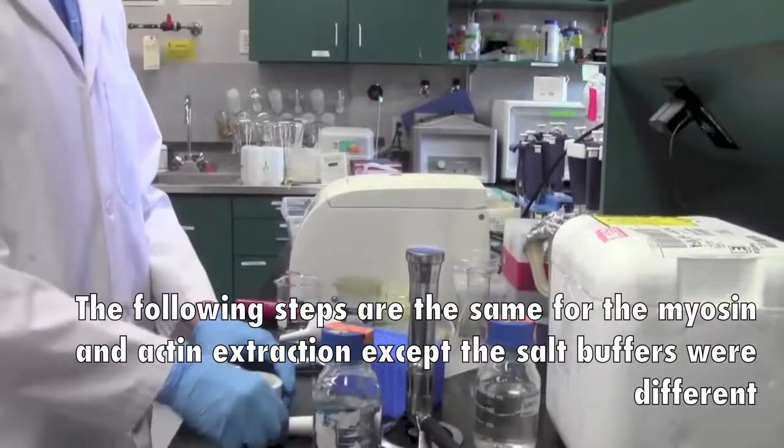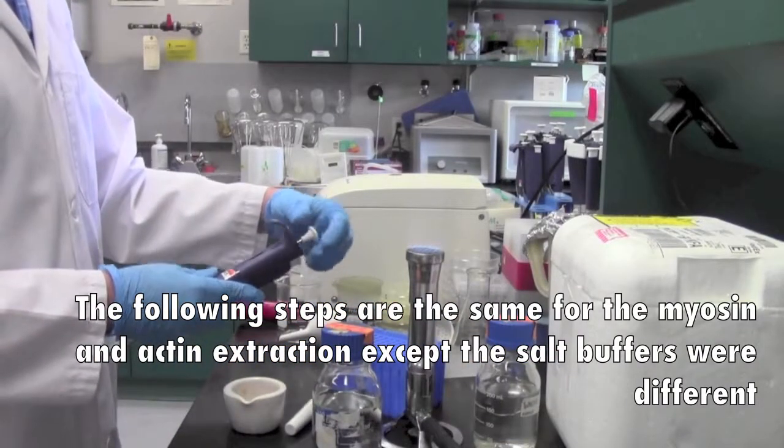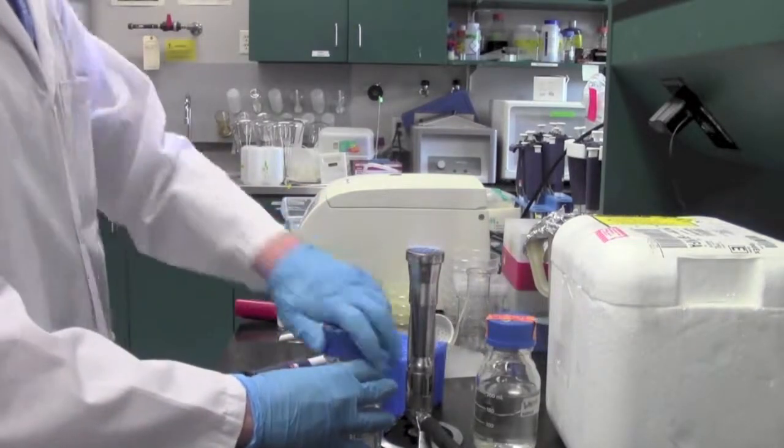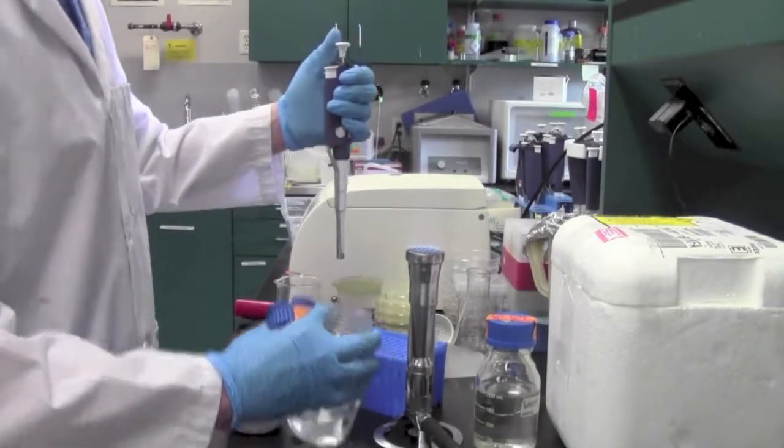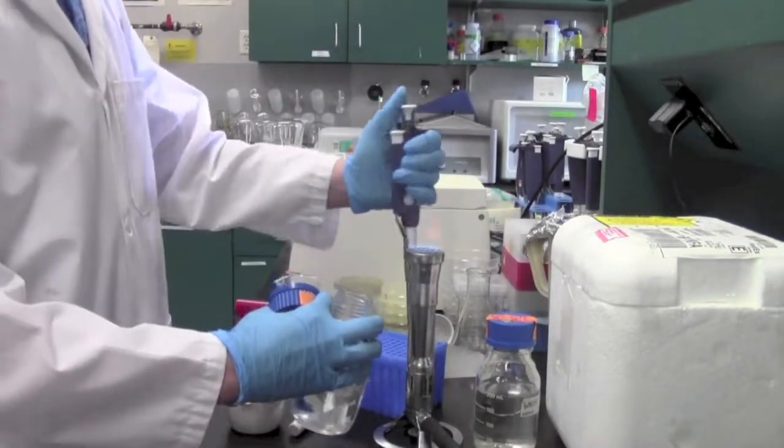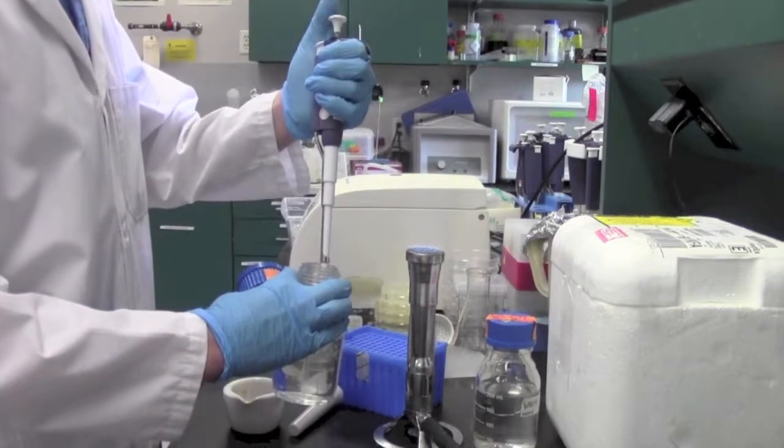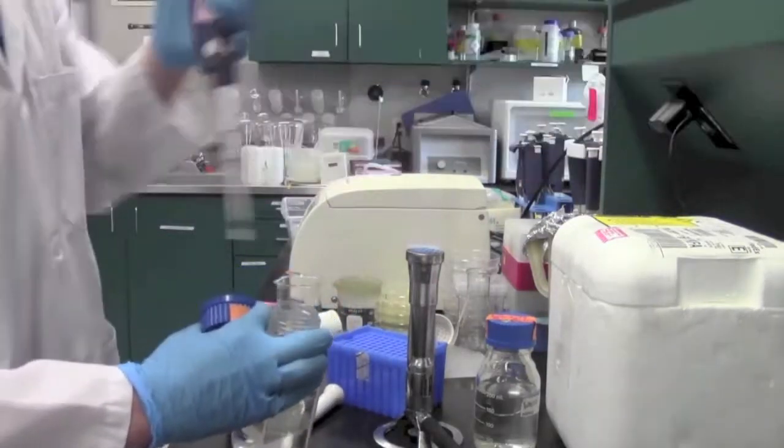So for the following steps, these were the same for the myosin and actin extraction except the salt buffers were different. Here I am adding the initial five milliliters of buffer to proceed with the grinding using a pestle and mortar.